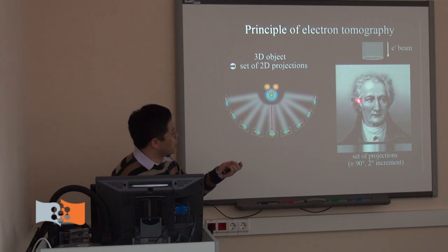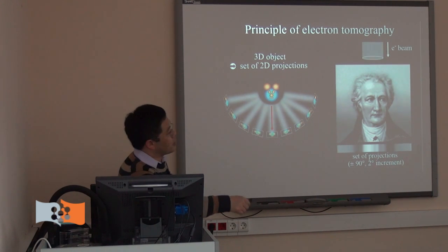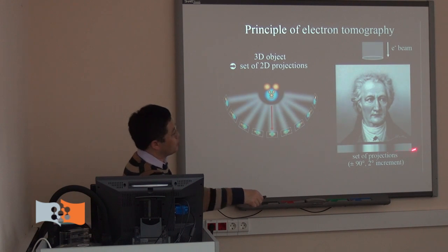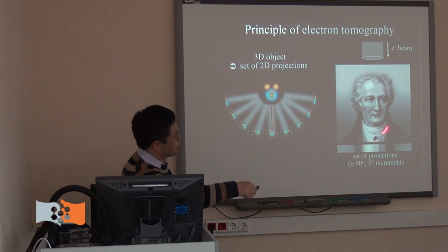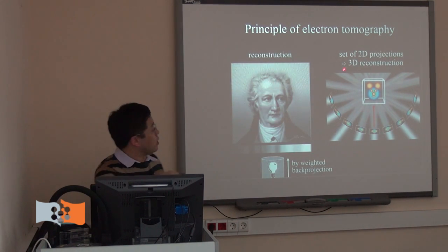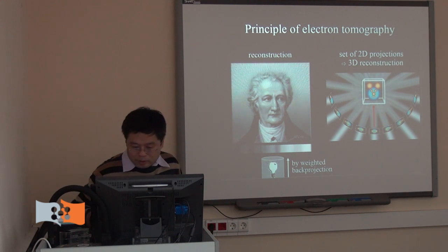If we take this 3D to 2D, let's use as an example going from 2D to 1D. So this is a 2D image. You just project in this way, so you get the 1D projection image of this one. Then you use this one.